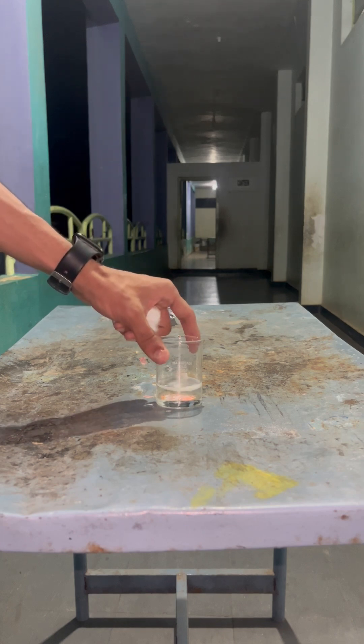Now we are taking a piece of cotton and adding it into the piranha solution. You can see the cotton is slowly dissolving in it. Improper addition is also very dangerous — always add the hydrogen peroxide into the acid, not the reverse. You can see the cotton is now completely dissolved.